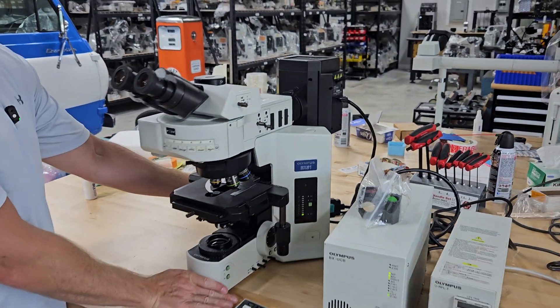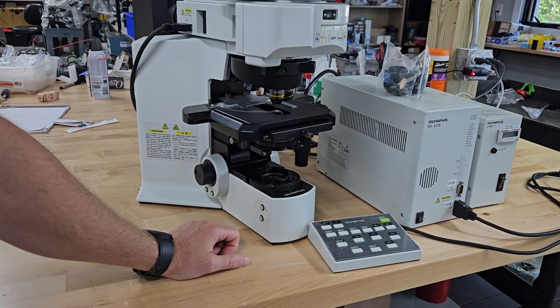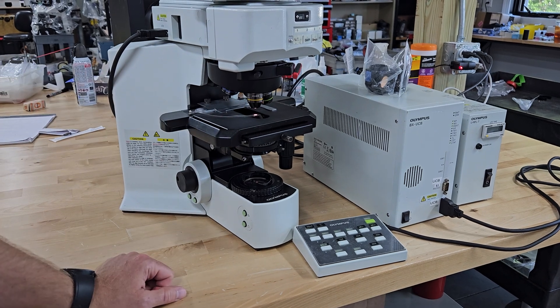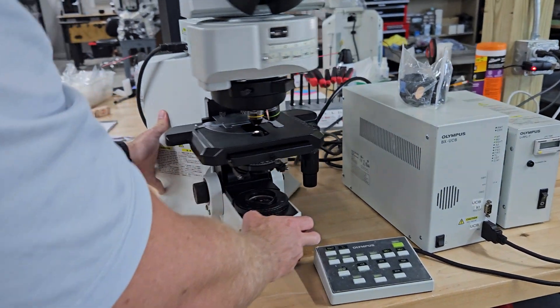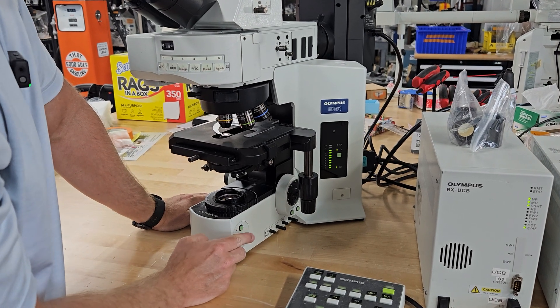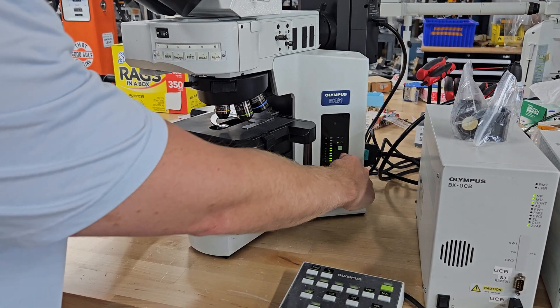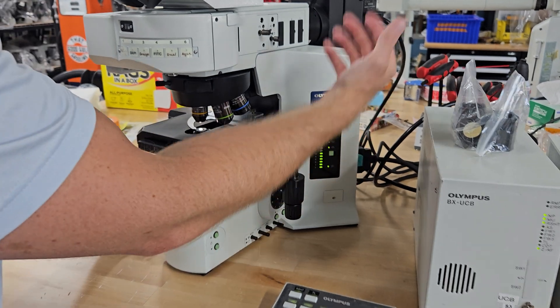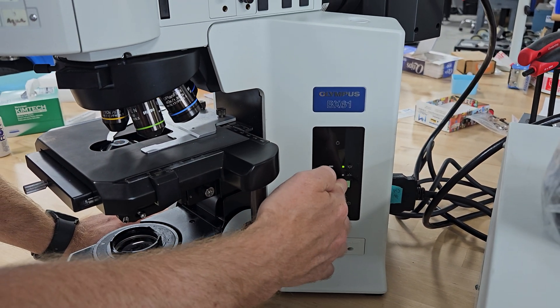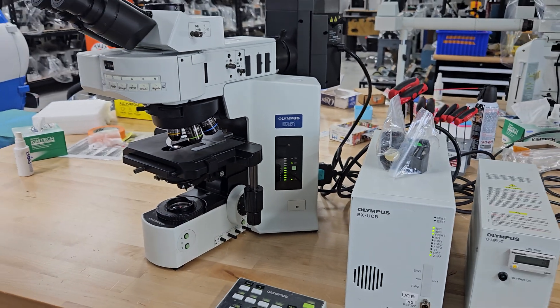Over here on this side, you have the power button. This is for your bright field on the microscope. The bright field light just came on — if you want to use the scope for bright field, that's how you turn it on. You can adjust the light right here — the light can go up and down. If you want to switch to the reflected light lamp house and there were two halogen lamp houses, you would hit this button. That's kind of the long and short of this microscope.